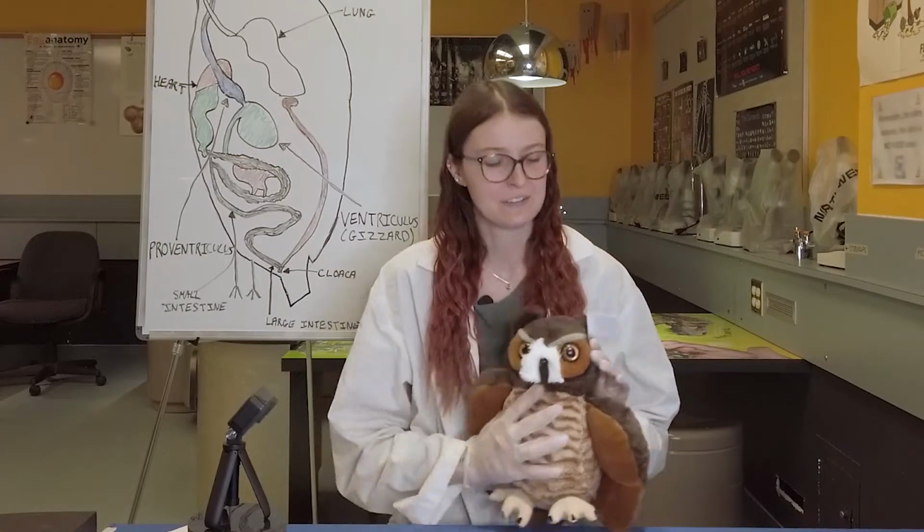I'm going to be talking about owl pellets and doing a dissection on one. An owl pellet is a ball of undigested fur and bones that owls basically throw up. This undigested fur and bones are from the prey that they eat. Owls eat small rodents and birds, and when they eat their prey, they actually eat it whole.